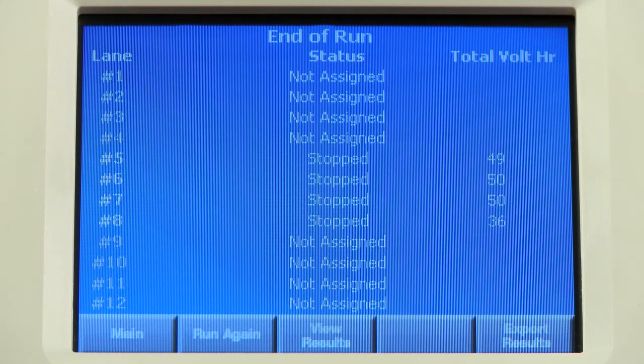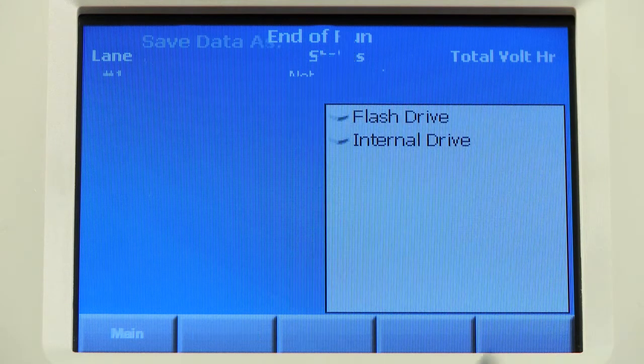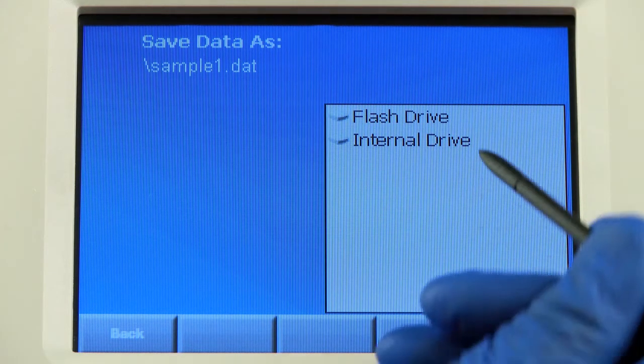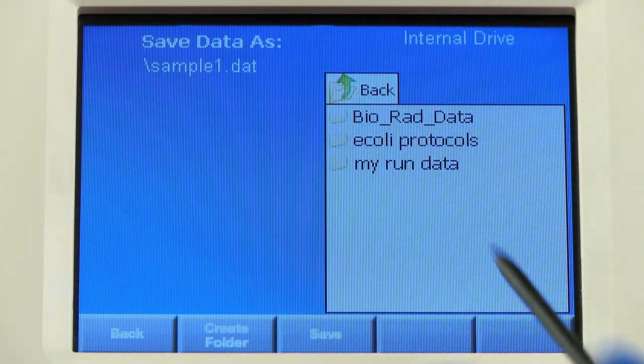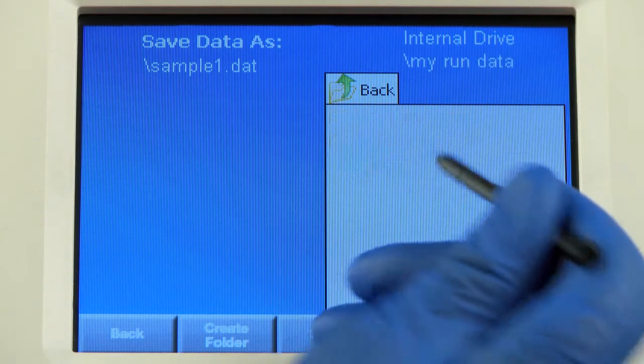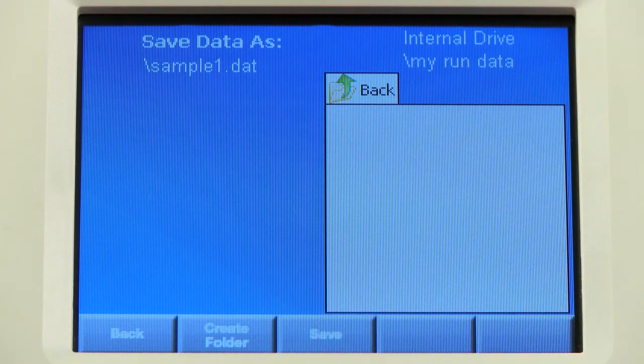In addition, you can save the results by pressing Export Results. Navigate to the location where you would like to save the results and press Save.